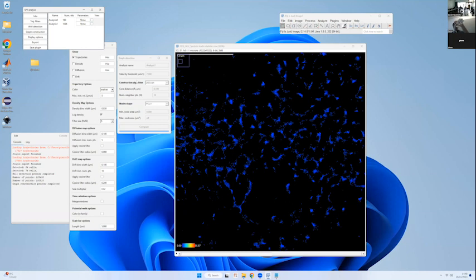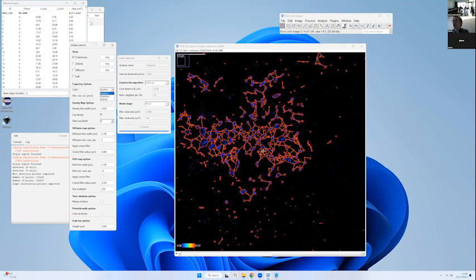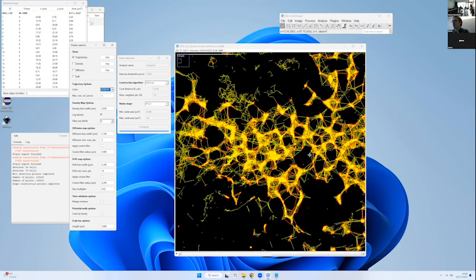Okay, so let's finish because I have to leave soon. Yeah, okay. So there's just one more thing. Oh, you got this? So wait, so you did calculate? You have it? Where is it? Yeah, compute.